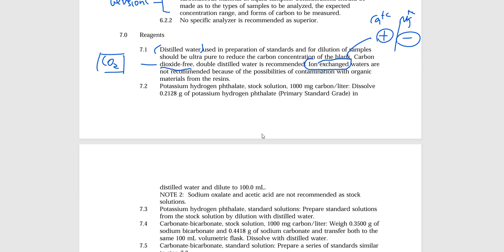I will say, though, we are in motion, and by the time that you take the course, we will have ordered an ultrafiltration system that will basically help us get to that moment. Not a full distilled water type of environment or instrument, but folks, this is going to be super clean water. Almost, not quite, pharmaceutical grade water, but it gets us really close to that point for sure.